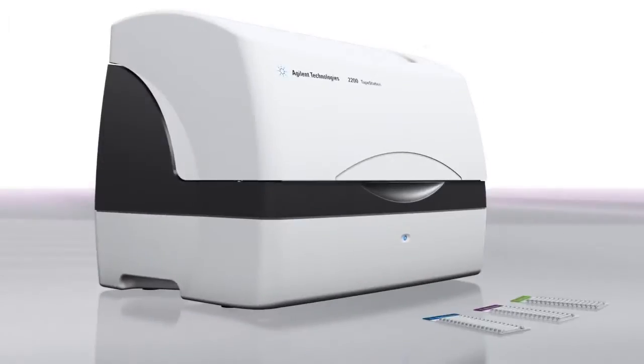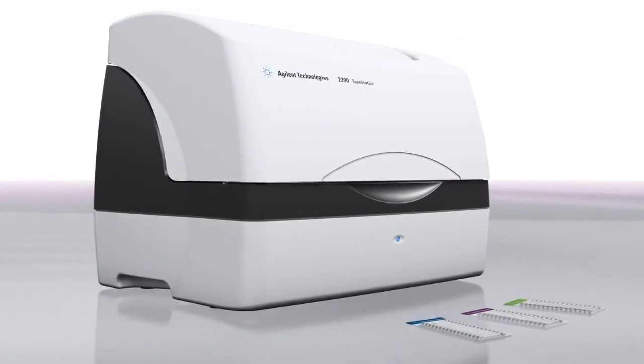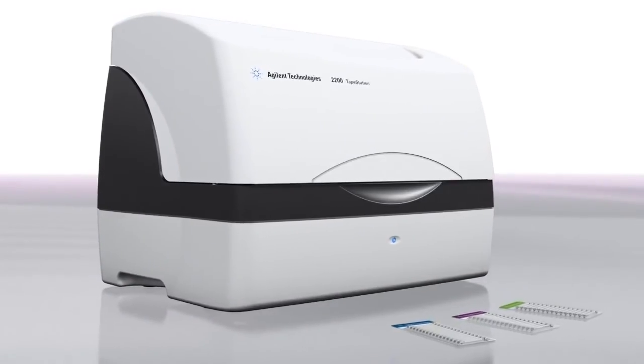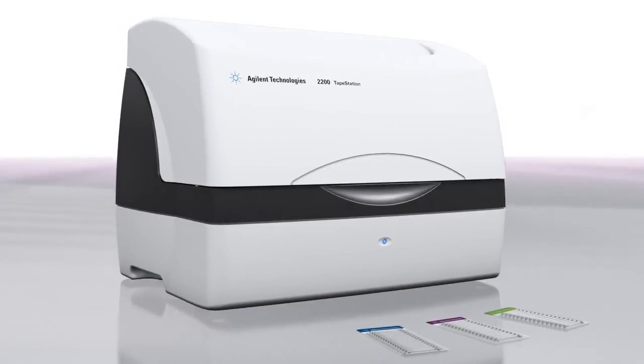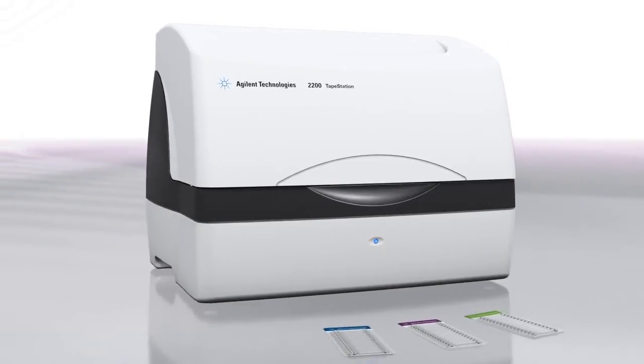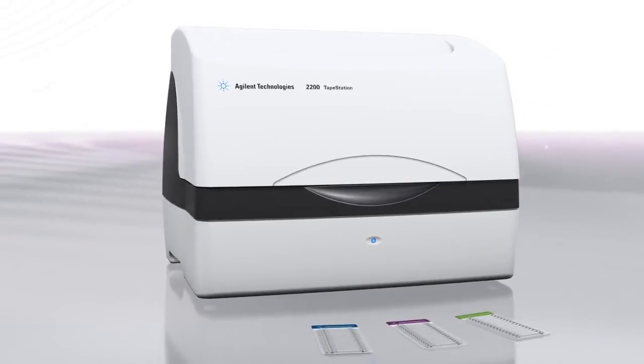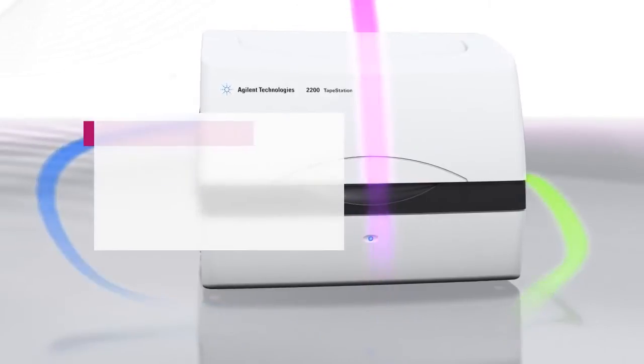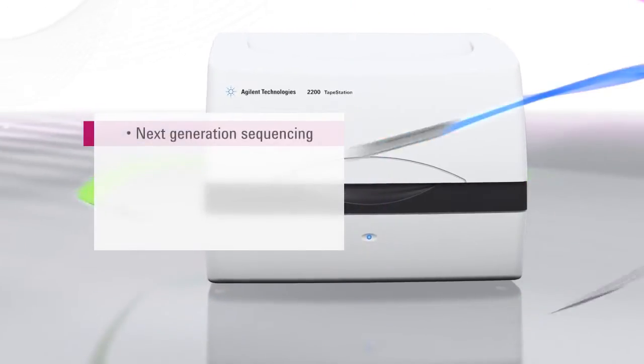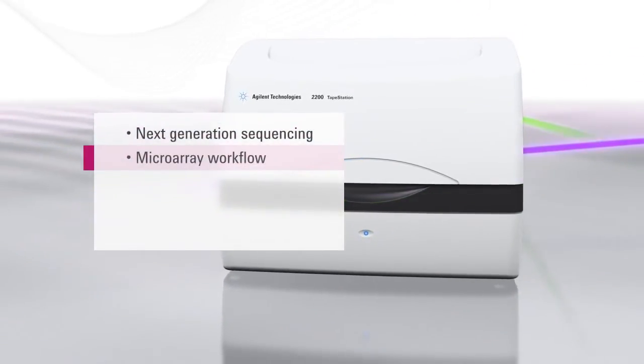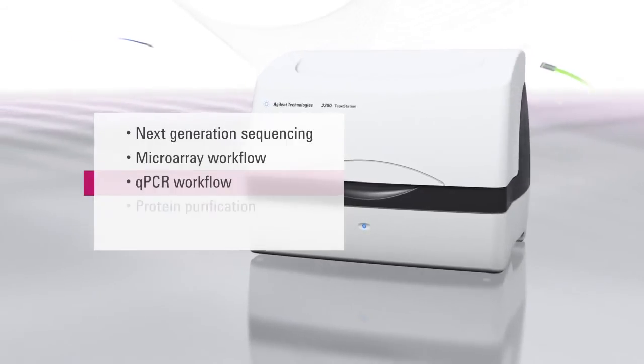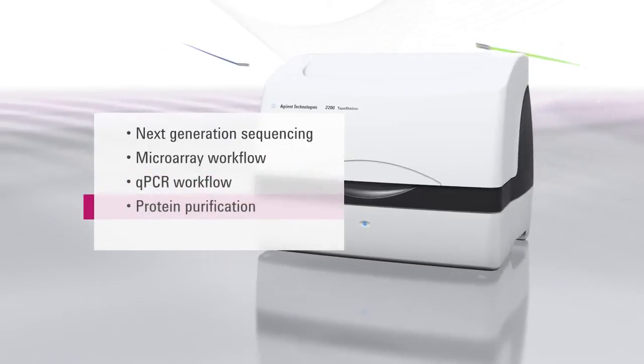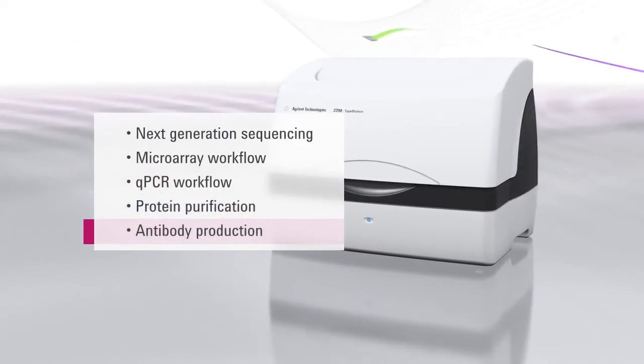Offering rapid results and scalable throughput, the Agilent 2200 tape station is an ideal easy-to-use solution for quality control of biological samples in next generation sequencing, microarray and qPCR workflows, as well as in protein purification and antibody production.